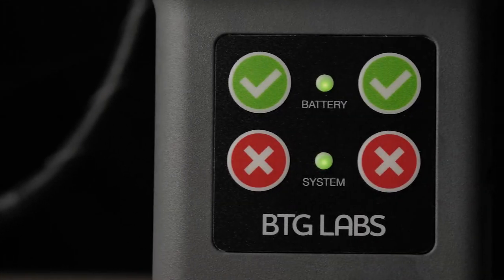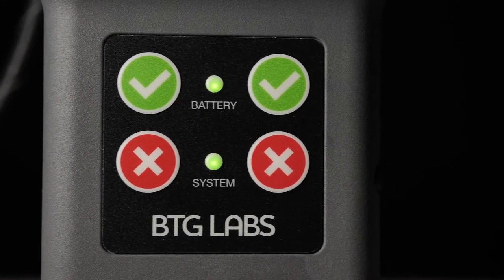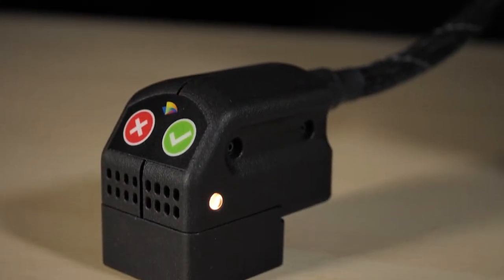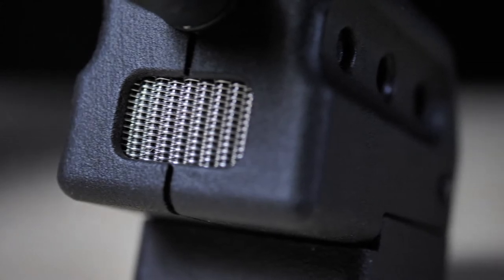Through the push of a button directly on the body of the 5001 or using the extended controls on the Universal Inspection Head, users retrieve precise quantitative surface quality data rapidly.